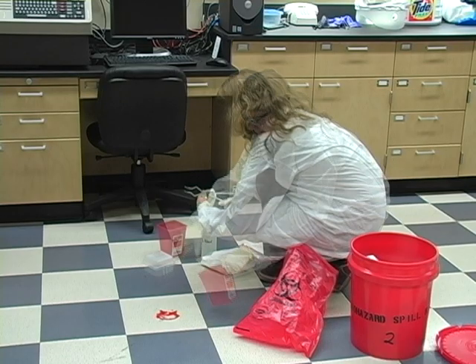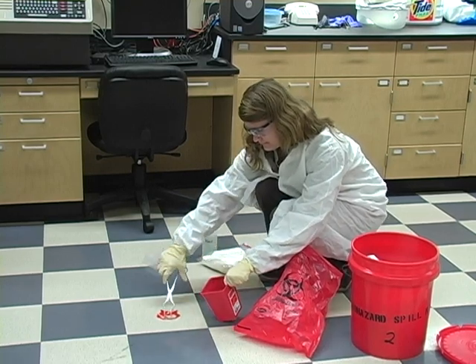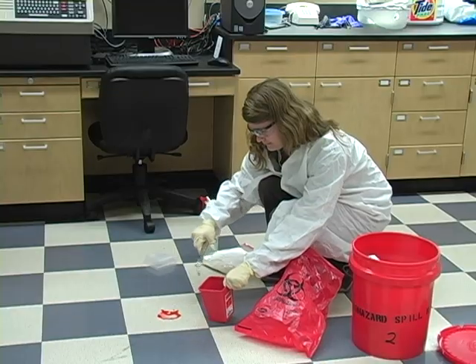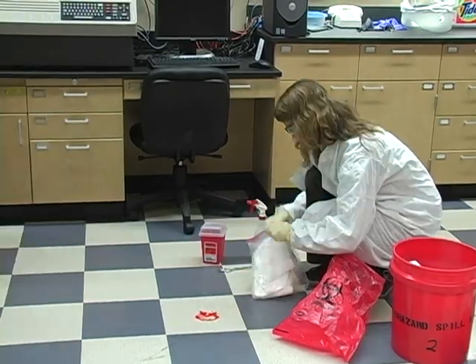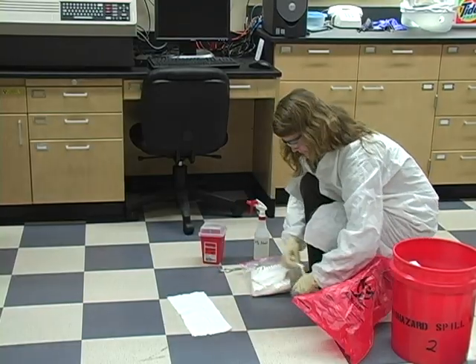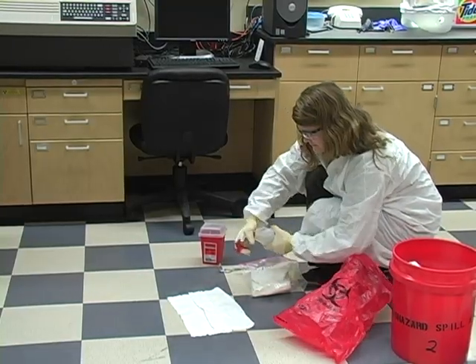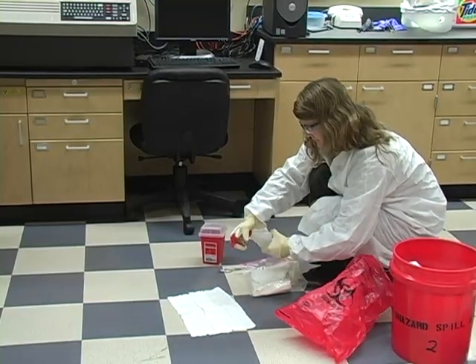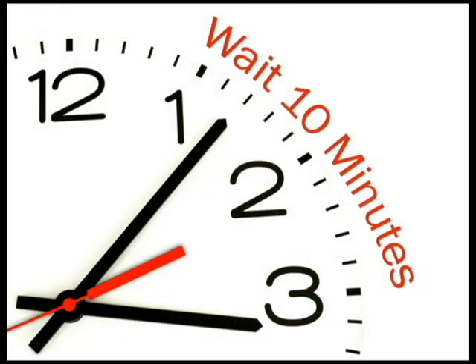The next step is to clean up. Before cleaning any blood-borne pathogenic material, use your tongs or other tool to remove any sharp pieces. Then carefully cover the spill with absorbent towels, making sure to lay them out in a single layer. Spray a tuberculocidal disinfectant onto the towels, making sure to use enough to soak through. Allow time for the disinfectant to work, which is usually around 10 minutes.